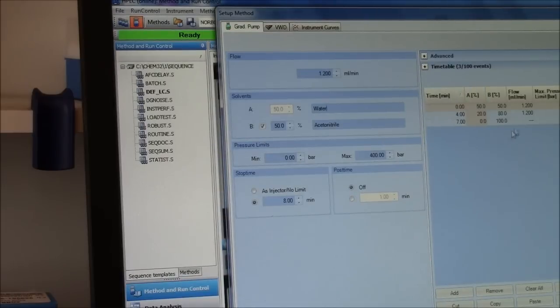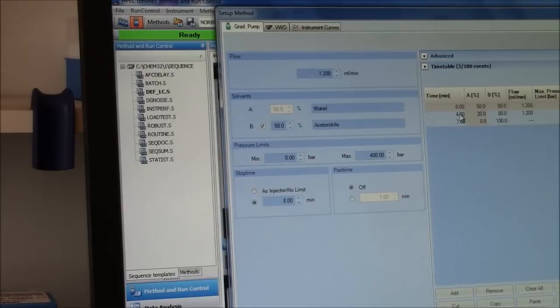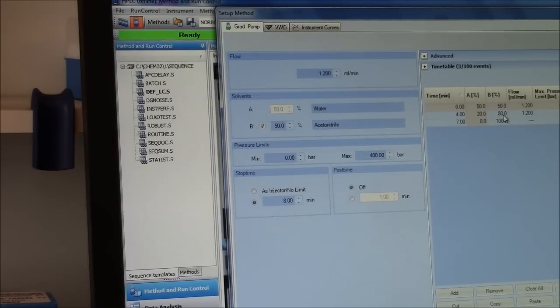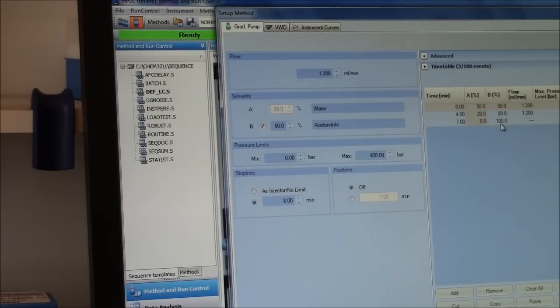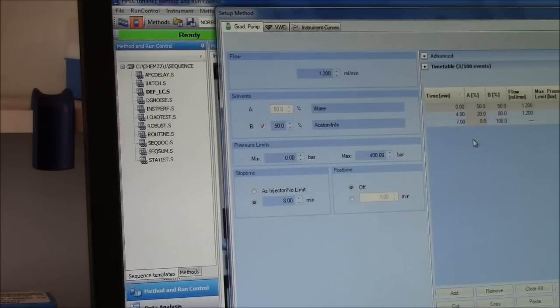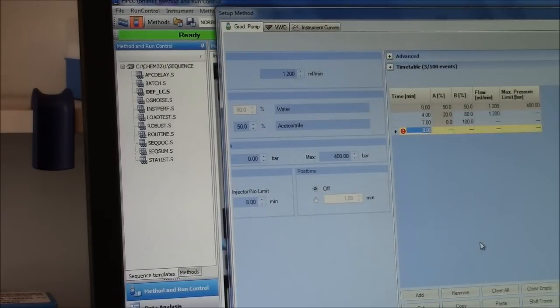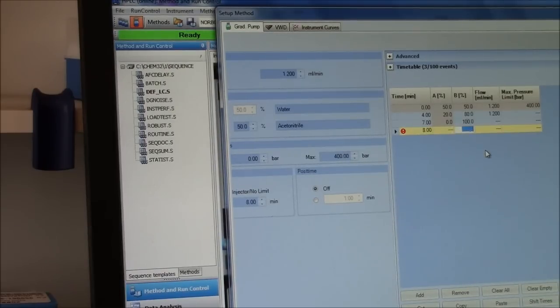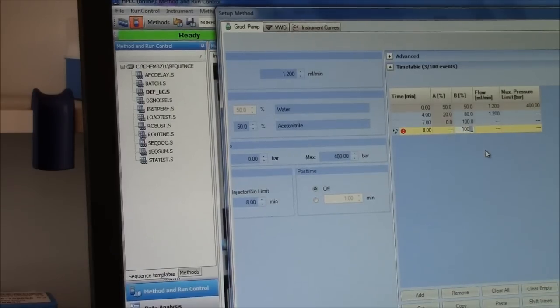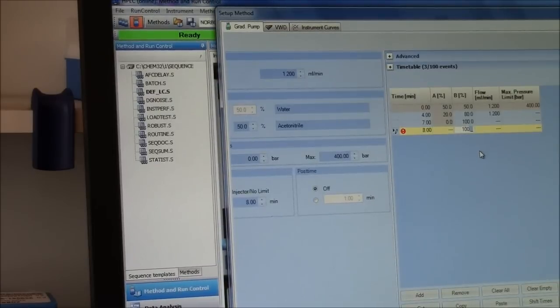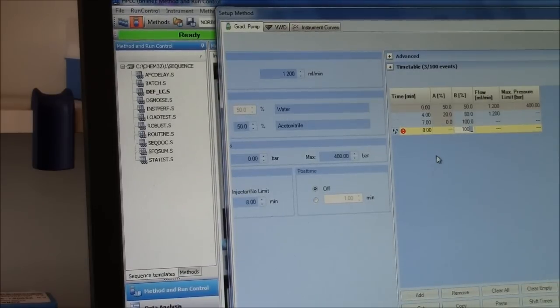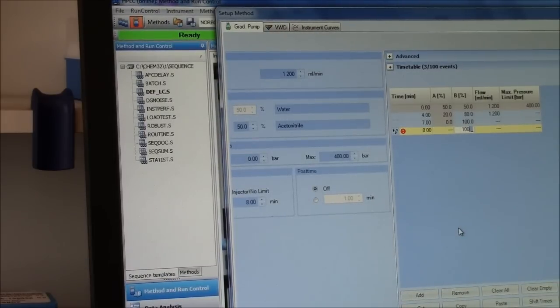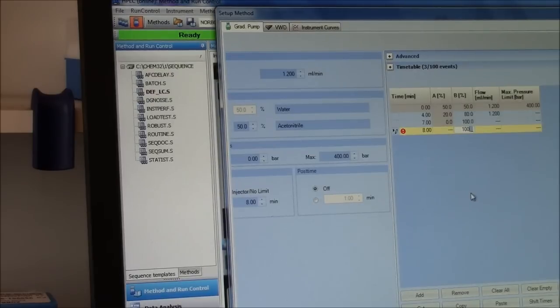Over here I have a gradient. So between 0 and 4 minutes, it will go up to 80% acetonitrile. From 4 to 7, it will go up to 100% acetonitrile. I am going to add one more bit here where from 7 to 8 minutes it will remain at 100% acetonitrile. So that should be enough to get the molecules off the column.